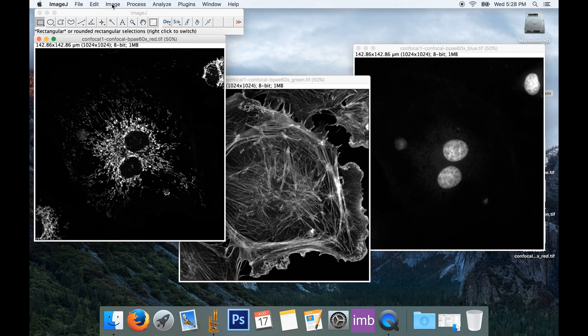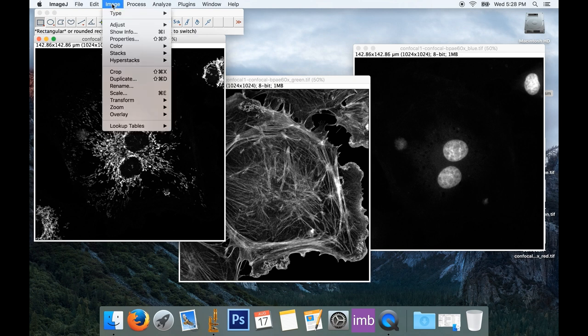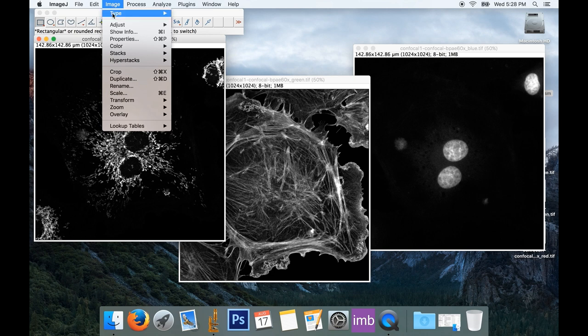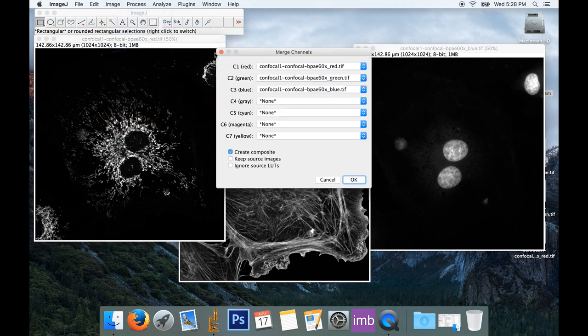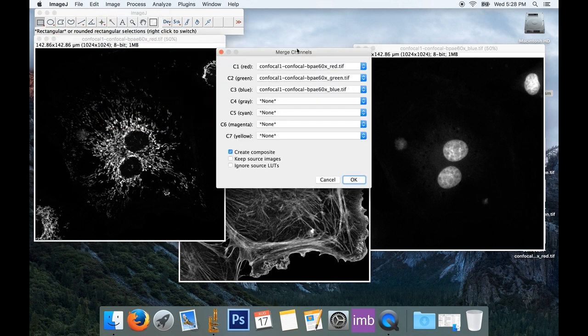Again, select Image. And here we're going to go back down to Color, and we're going to choose Merge Channels. And that brings up our Merge Channels dialog.